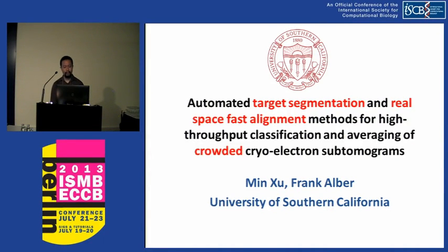I'm going to present an automated target segmentation and real space fast alignment method for high throughput classification and averaging of crowded cryo-electron subtomograms.